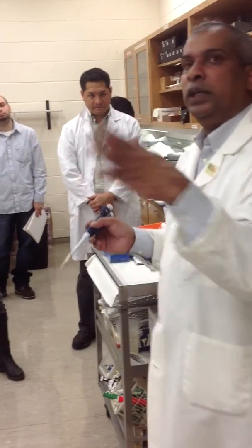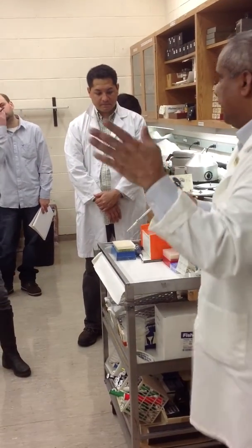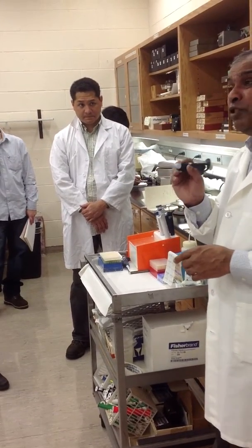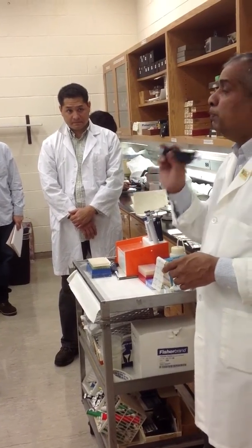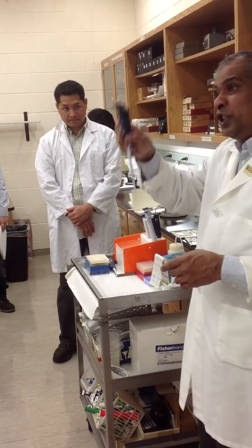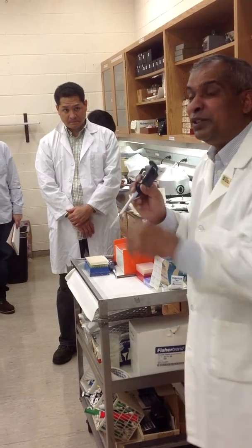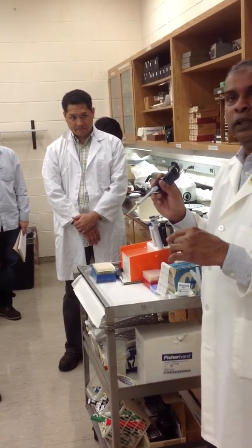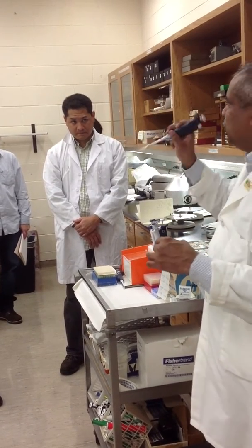We're pretty much stuck in the micro level, not nano and pico. But in the lab, they go up to 10 to the minus 12. That's how much plasma or serum is taken by the machine. 1 femtoliter, 10 to the minus 15 of a liter, is what the machine will pipette out to do certain tests.